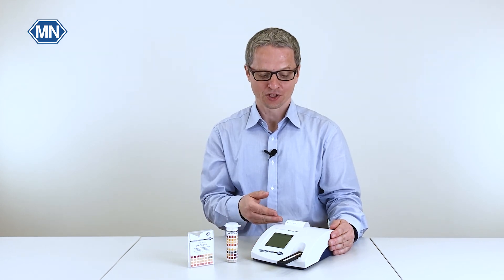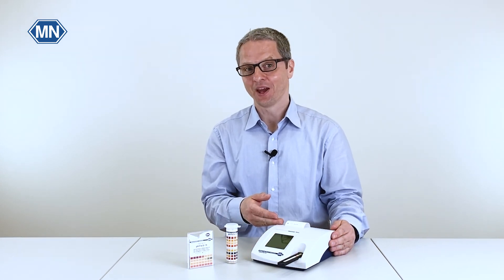So the Quantofix Relax may be a good addition to your pH testing, especially if you need safely documented results. Thank you!